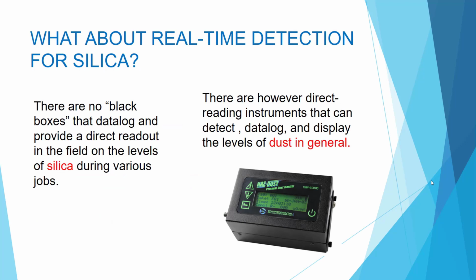In closing, let's talk about the real-time detection of silica. There are no inexpensive black boxes that data log and provide a direct readout in the field on levels of silica. There are, however, direct reading instruments that can detect, data log, and display levels of dust in general.